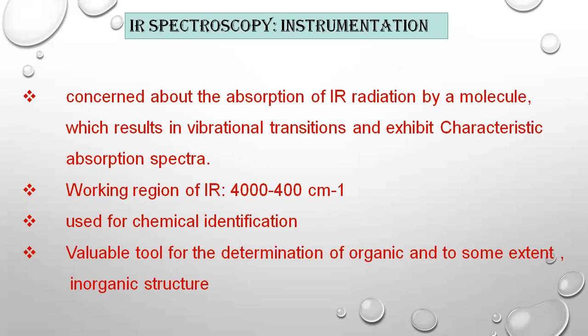IR spectroscopy is generally used for the determination of functional group. So by the detection of functional group, it is helpful in chemical identification. So it can be a valuable tool for the determination of organic and to some extent inorganic structures.